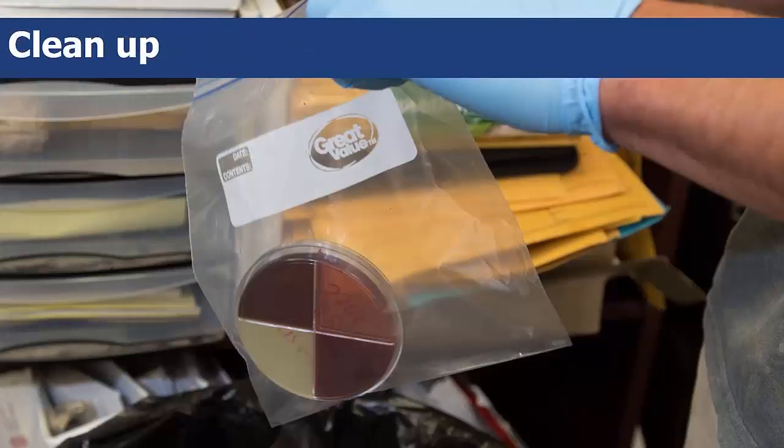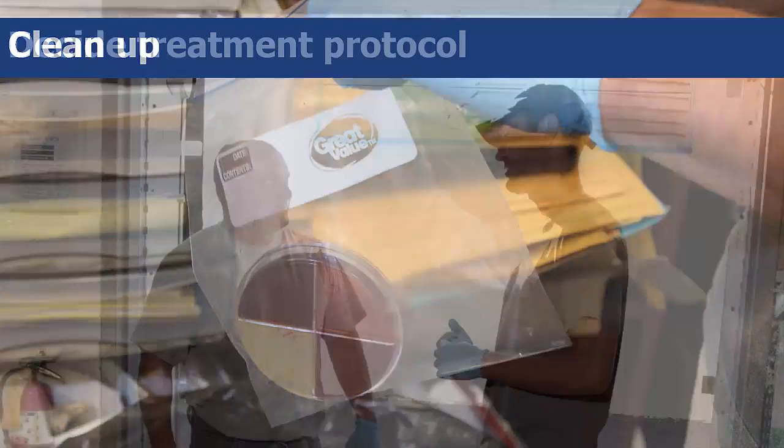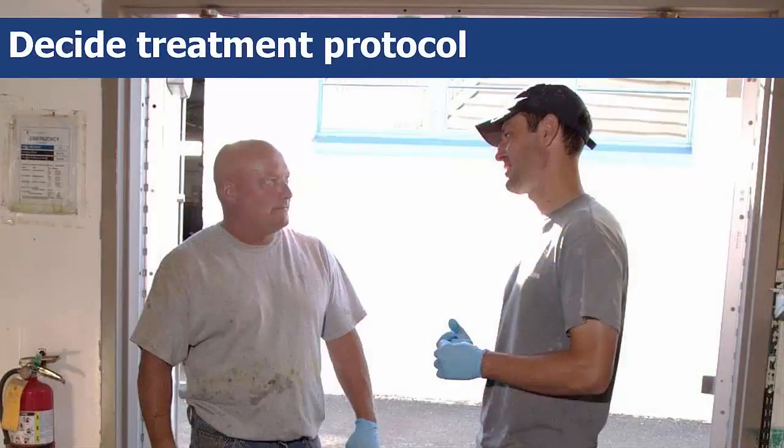Once you have completed analyzing the quad plates and recording your results, it's time to clean up. Since you're working with biological waste, you'll need to flood each plate with bleach and seal the quad plates in zip-lock bags before disposing of them in the trash. For follow-up and treatment, consult with your herd manager and veterinarian to set up a treatment protocol based on your culture results.